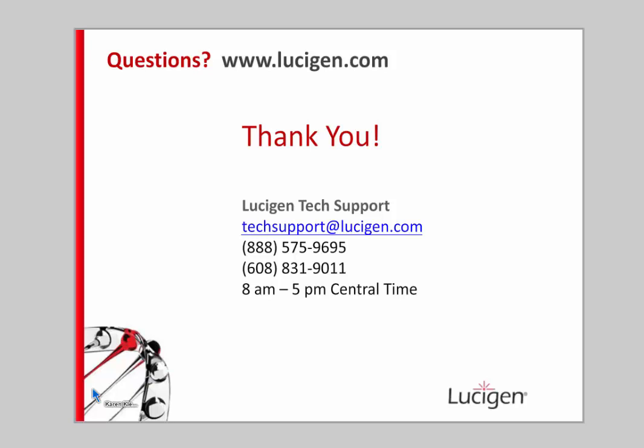I think it depends. In all the gels that I've shown today, some of them were done on a larger scale and some of them were done with an 8-well sonication tip. So we can absolutely get you those conditions as well. If you want to contact tech support with your information, we'd be happy to help you out with the conditions that we've used. And if there's a particular figure that you're wondering about the sonication conditions for, we can get that information to you as well.